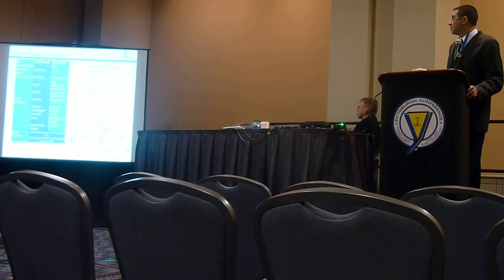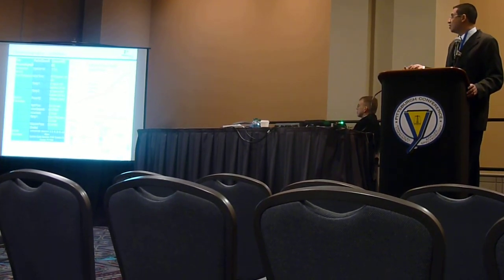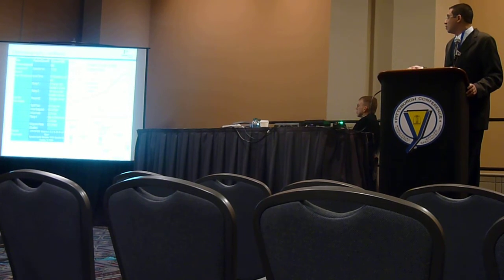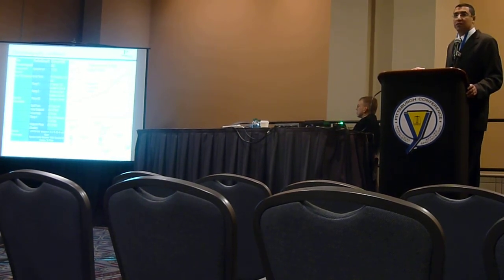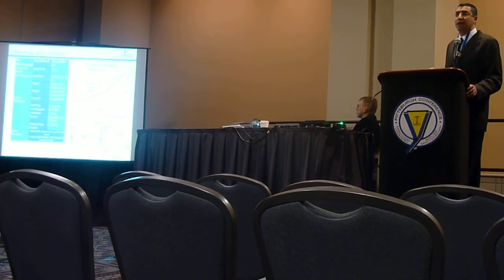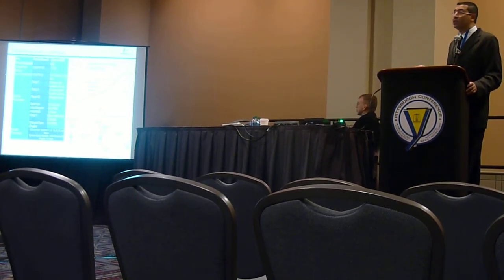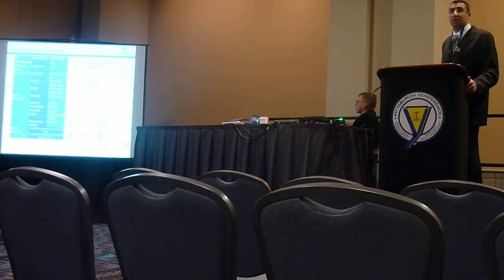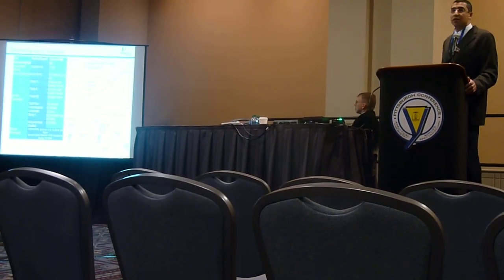This is the experiment parameters, the GC. As I mentioned, I started the experiment when my head pressure was at 45 psi, and then I lowered it to 2, where my midpoint pressure is still stable at 33. When that dropped down, I started backflushing. In the meantime, I maintain the flow into the analytical column, where the separation will happen in the main column. And these are the temperatures that are programmed throughout the experiment.